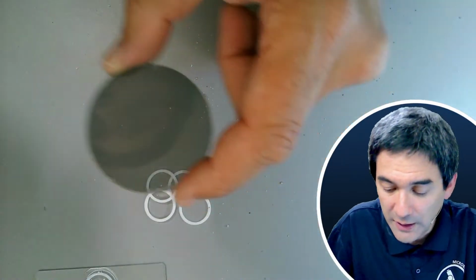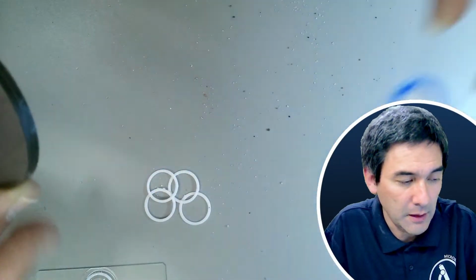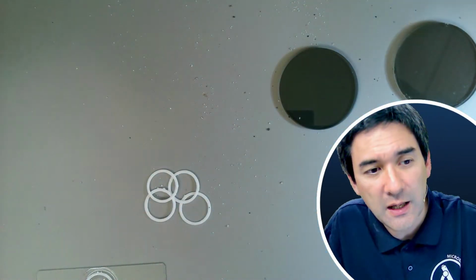So what I'm going to do now is I'm going to try to see how this looks, and of course you want to have the stereoscope view again. Now I need light from the bottom, okay? That is important. This is basically light from the bottom. Let's do it like this.